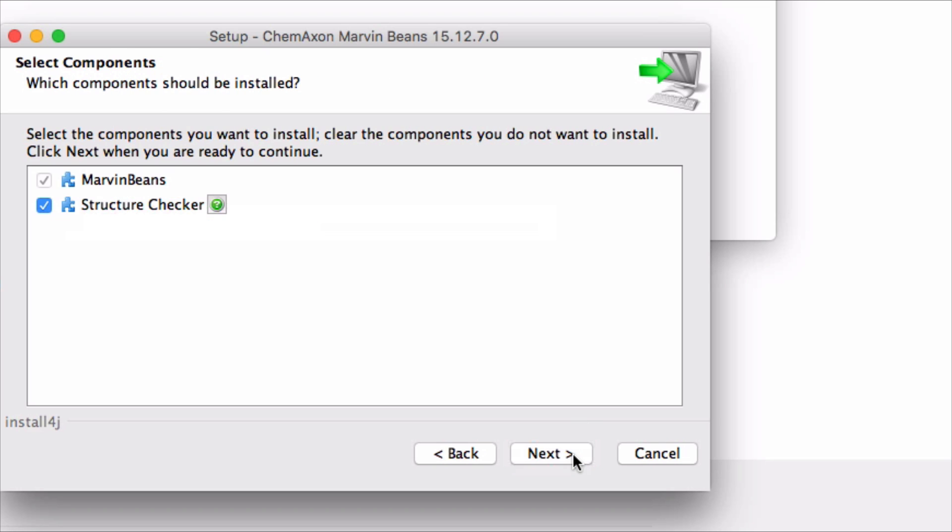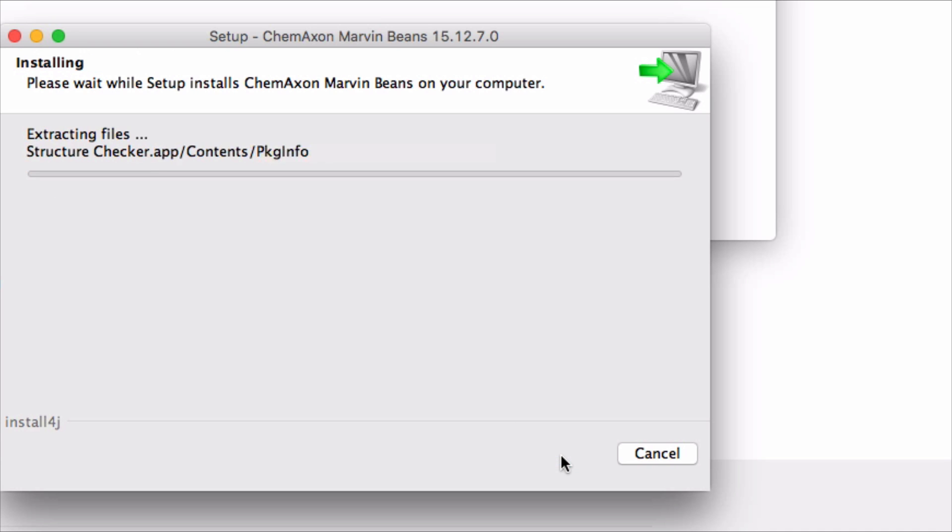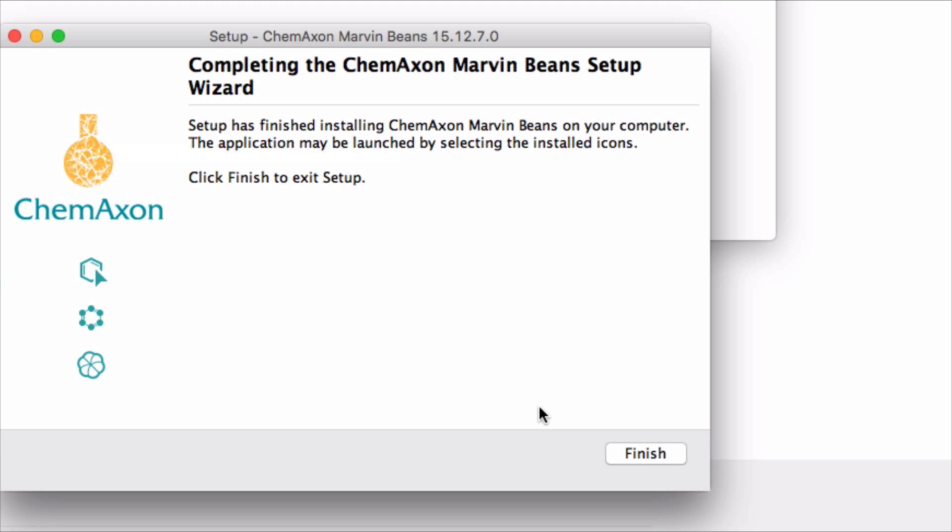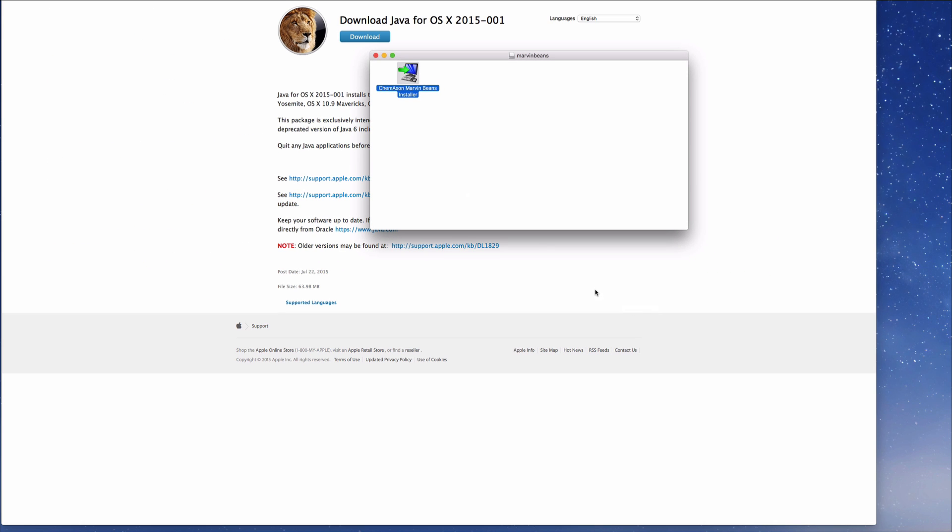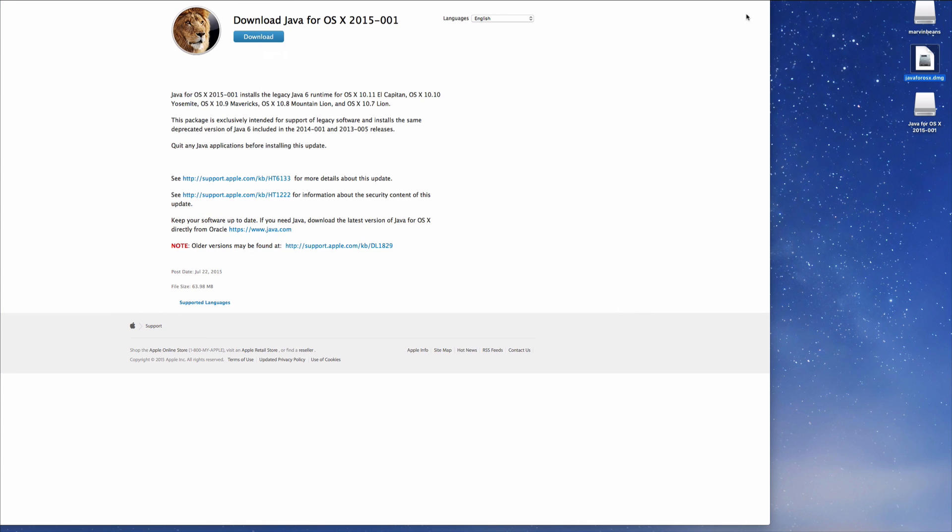Navigate your way through these screens following my suggestions. Now Marvin Beans will begin to install on my computer. Once it's finished, let me do a little housekeeping to give a cleaner look.